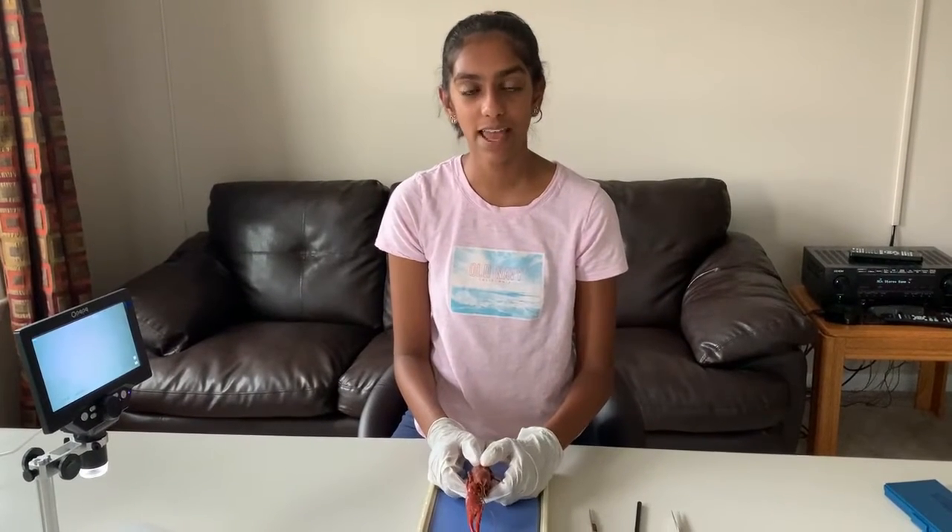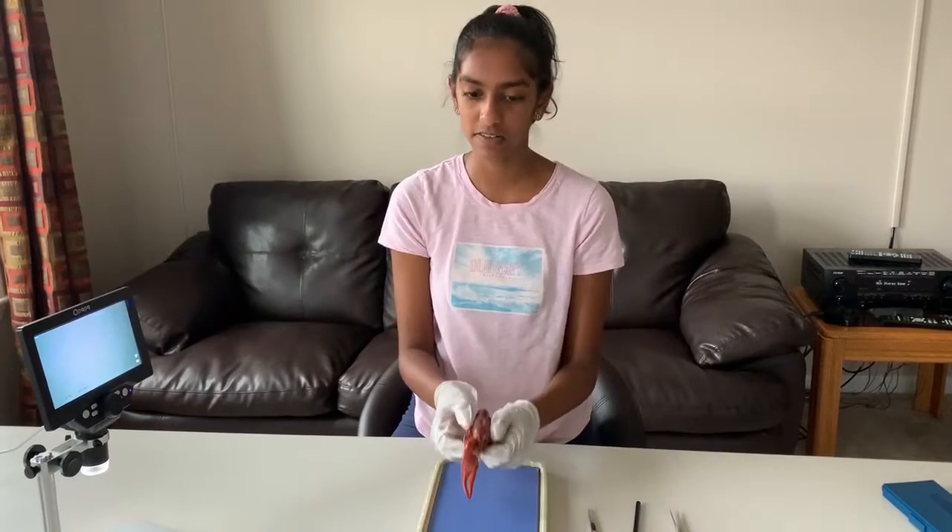Hi everyone, welcome back to another dissection video. Today I will be dissecting a crayfish.